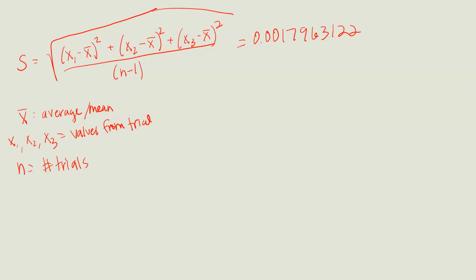Now, this is a calculated value based on data values, so we do have to apply significant figures to it. The way you're going to handle significant figures, I'm going to use my average. Let's say my average was the average that I calculated on the previous example.